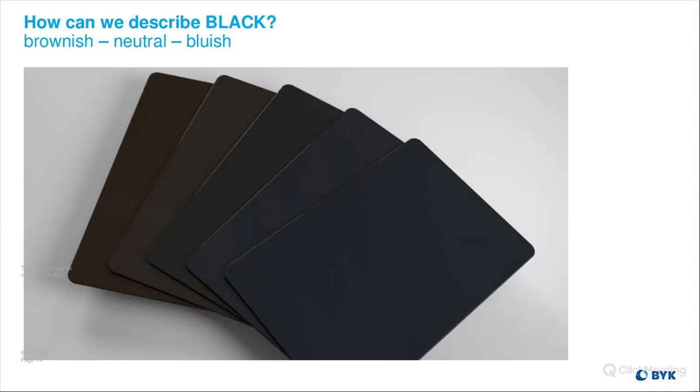And what's special about jet black samples is that they have little to no reflectance, meaning when light shines on the surface, the spectrophotometers work by measuring the reflected light off of that surface and then putting those into color values. And what happens with the black is that there's inherently so much absorption of light that there's almost zero reflectance data, and therefore you have zero data to create color values off of.